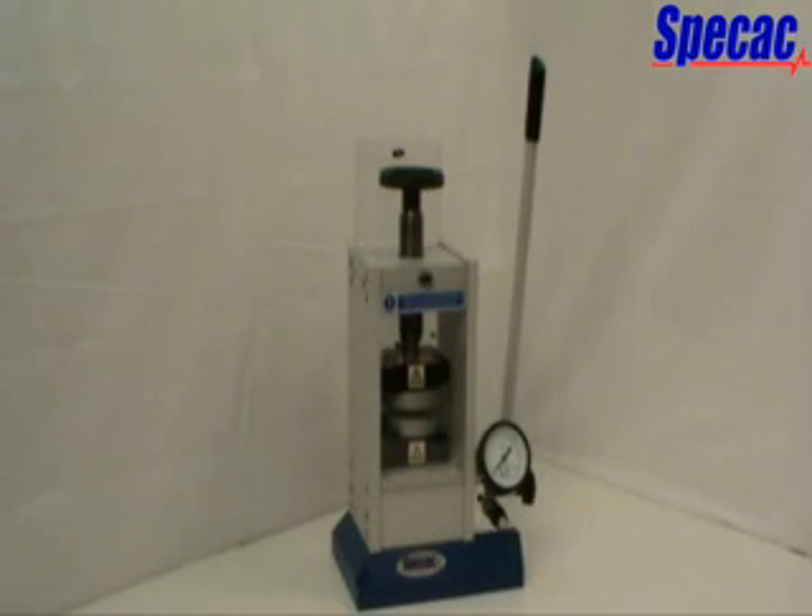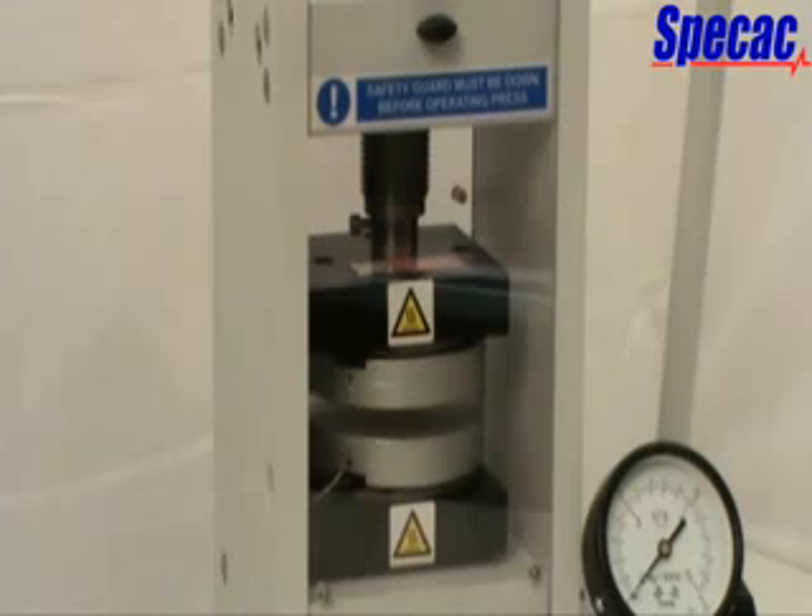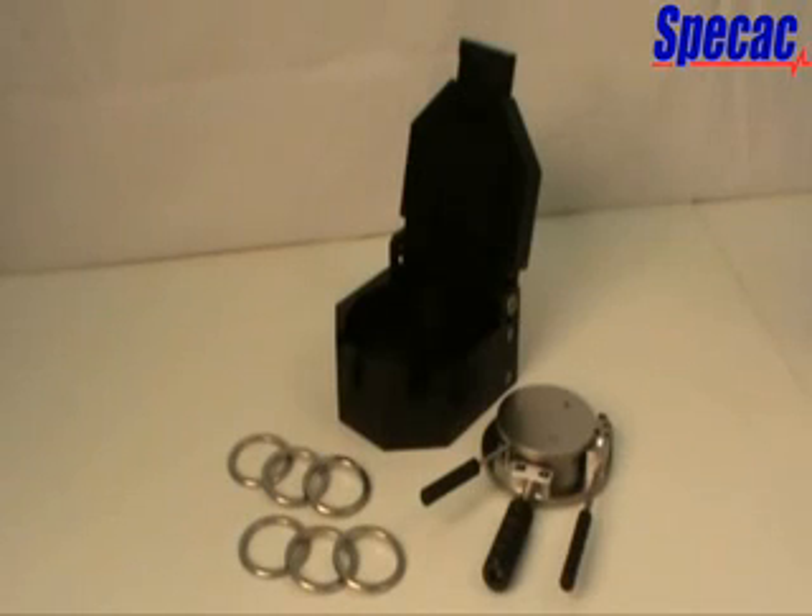The 15-tonne manual hydraulic press can be adapted to provide heating pressing surfaces up to 300 degrees centigrade by use of the Atlas heated platens and temperature controller system, part number GS15515. The upper and lower Atlas heated platens are shown when installed into the 15-tonne press. The Atlas heated platens are used for the preparation of thin films with the Atlas Constant Thickness Filmmaker Accessory, part number GS15640, for samples that melt up to 300 degrees centigrade.